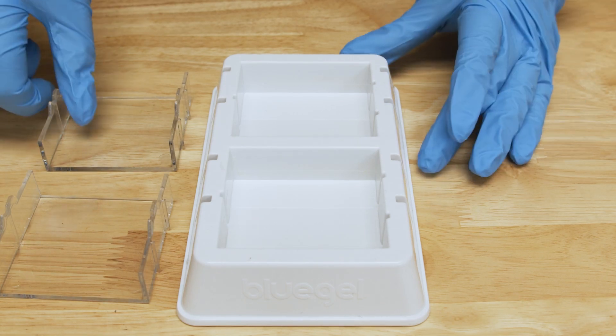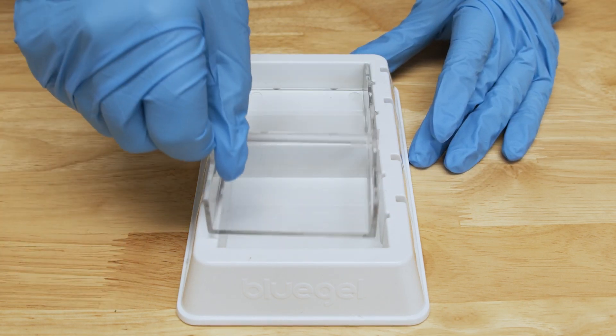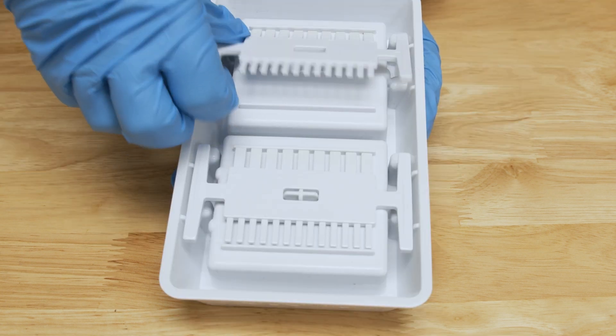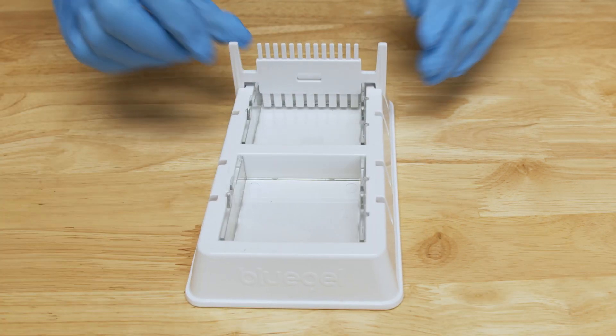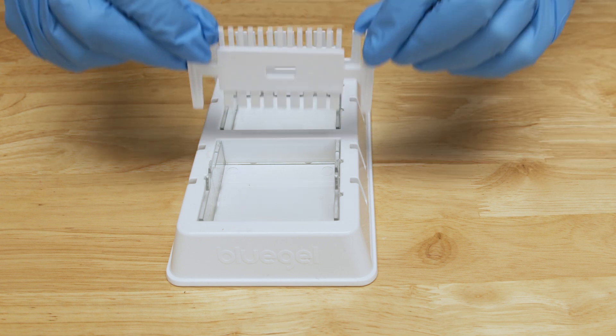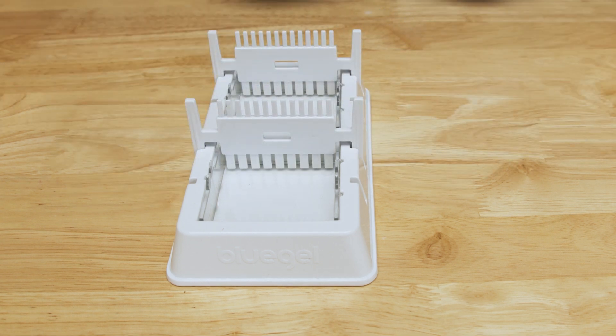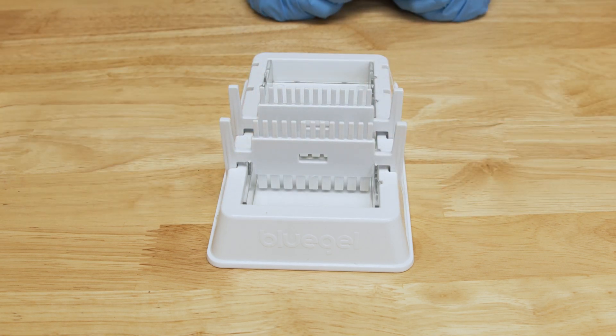Before pouring your gel, you want to set up your gel casting platform. Place the clear gel tray into the white casting platform. Place the comb in the notches of the platform at the end of the gel tray. For users new to pipetting, we recommend placing the larger side of the comb with fewer teeth down. If you need more wells in your gel, you can add a second comb to the second set of notches.